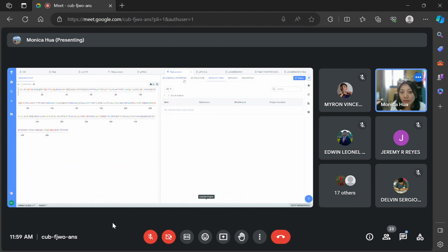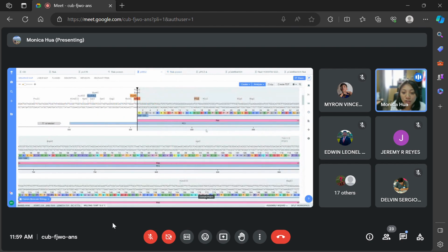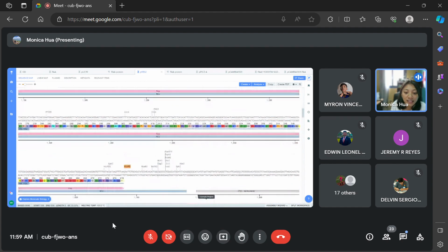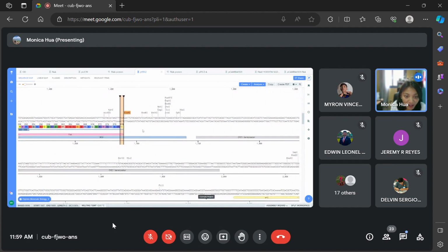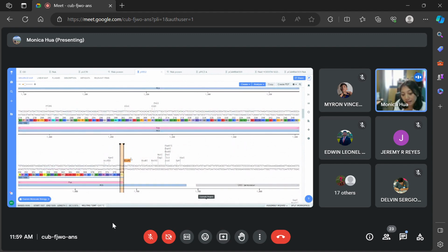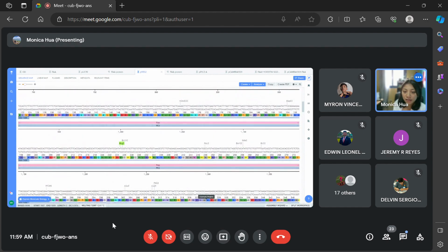But it should look like this. Here, ATG is supposed to be your methionine that starts translation. And in the end, if you have a little asterisk, that is the stop codon, meaning that's it. Done. Ribosome is leaving this site. Hasta la vista, dissociate.